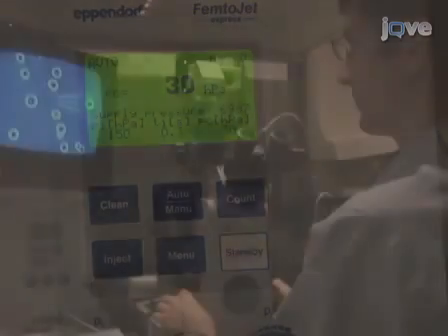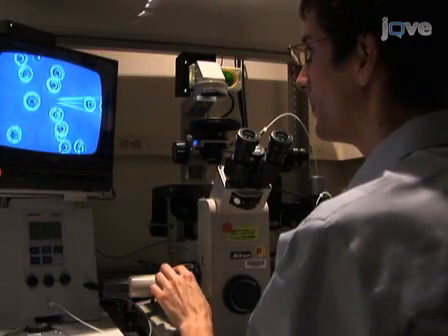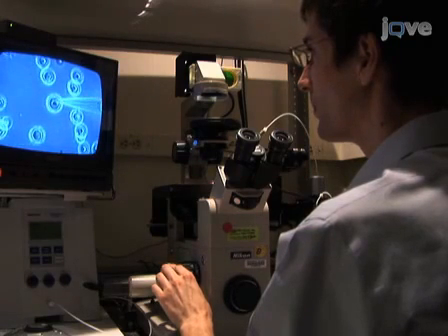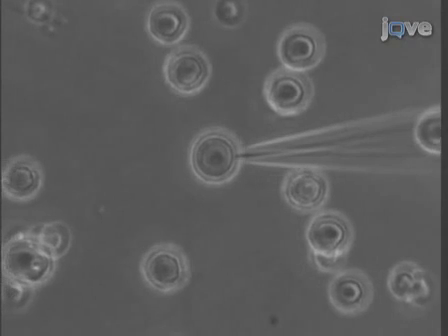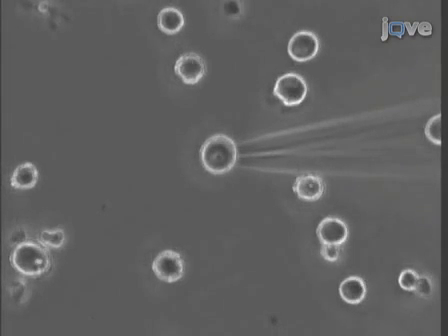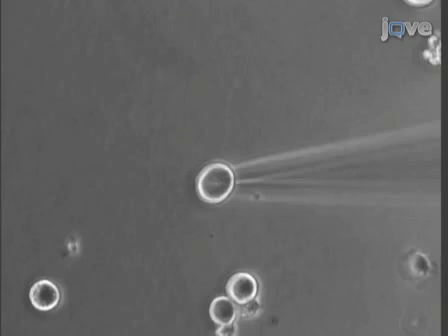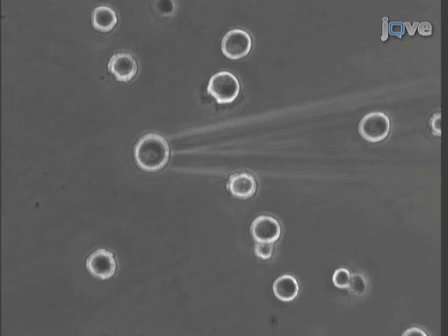Once the micromanipulator settings have been adjusted, intranuclear injections can be performed. Using the microscope's XY axis stage control, position the neuron under the tip of the microinjection pipette. Align the tip of the pipette above the center of the nucleus by focusing up and down between the tip and the nucleoli. Inject the nucleus by pressing the inject button on the micromanipulator. The injection of the relatively low viscosity cDNA solution often appears as a white plume in the nucleus when viewed under phase contrast optics.